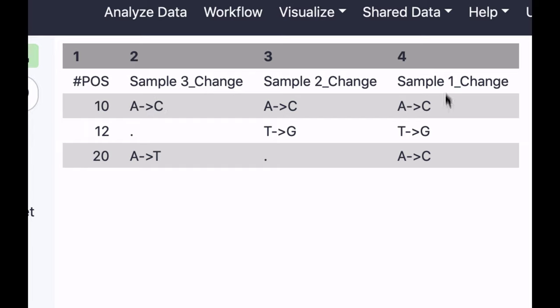So these are changes in sample 1, changes in sample 2, changes in sample 3. And you can see that empty datasets - there is nothing happening in position 12 in sample 3, for example - they are represented by dots.